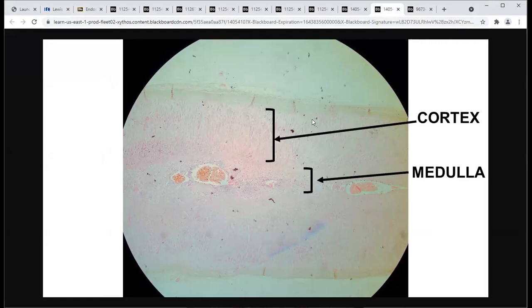Under the microscope, this thin tissue appears when we cut the adrenal gland in a transverse direction. And so in the middle of this adrenal gland, you see huge blood vessels. This is the strip of cells that make up the medulla.